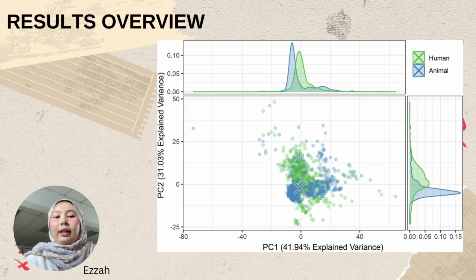The researchers analysed how the spectra of human bone differ from the spectra of animal bone. Both human and animal bone spectra are shaped by their molecular composition, but the absorption intensity and peaks vary depending on the relative amount of collagen and exposed mineral. Hence, each class will show different band intensity and clustering behavior after pre-processing.